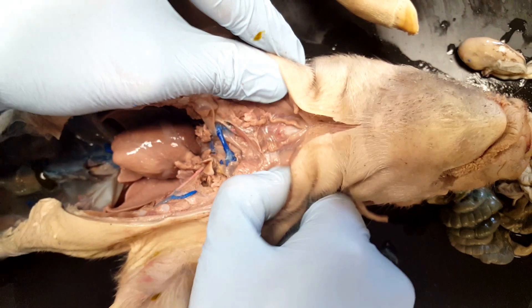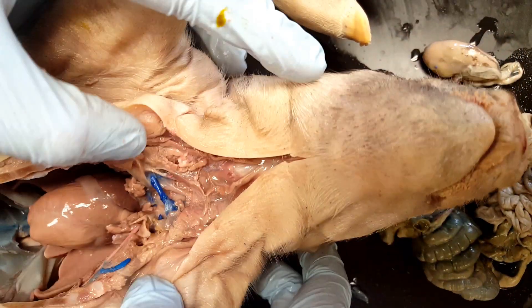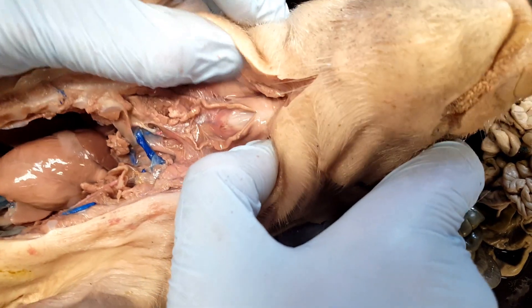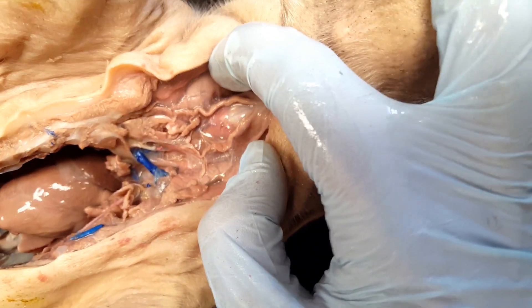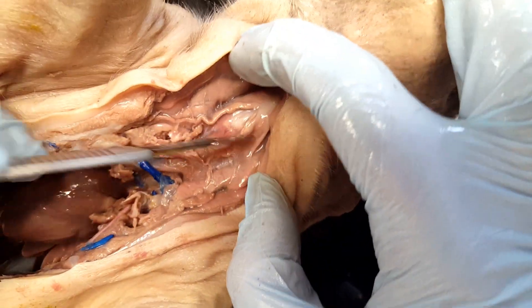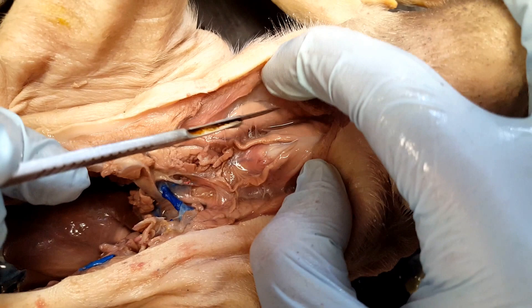If we move up, you've got the thymus, which is this huge organ in fetal pigs. You can see all this spongy tissue in here — lots of spongy tissue.